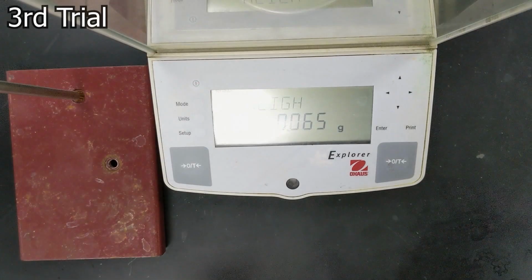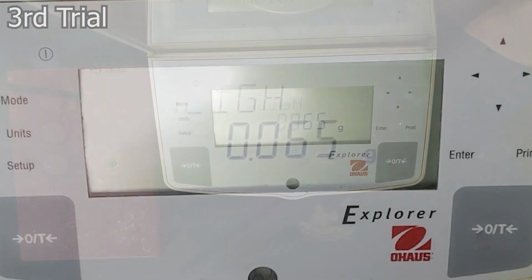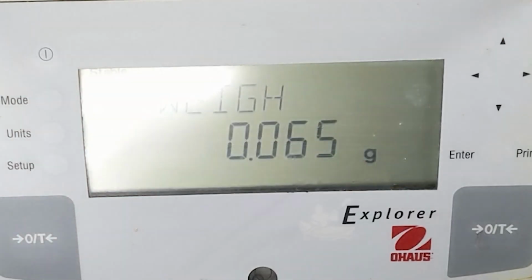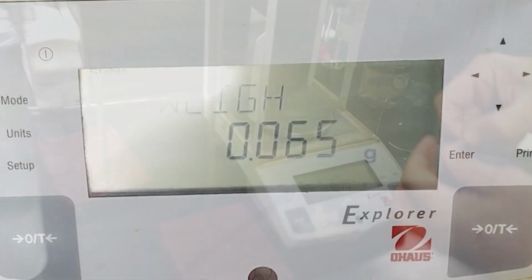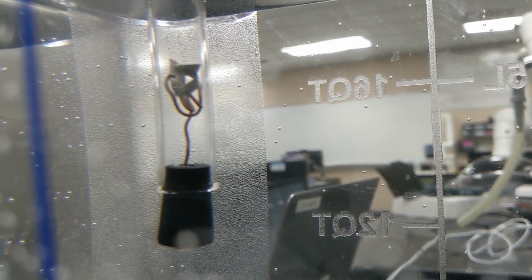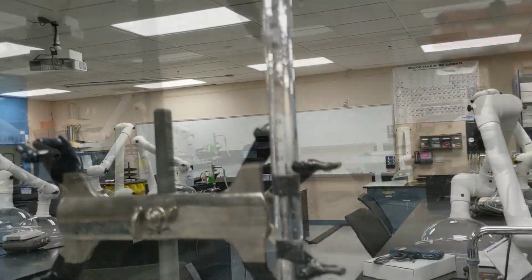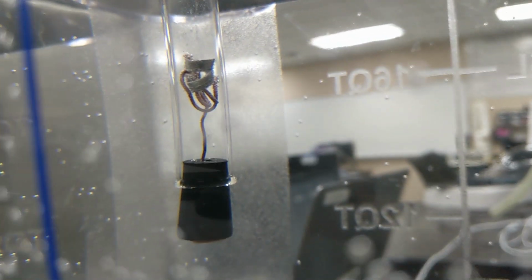Okay, so first thing we're going to do is get the mass of the magnesium. And then I'm going to put this onto my copper wire. Sorry, for some reason it turned off and you pointed out that it was 0, so I just wanted to show them it was 0. Sure.